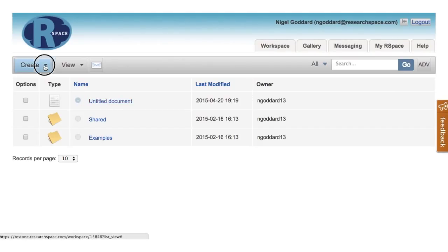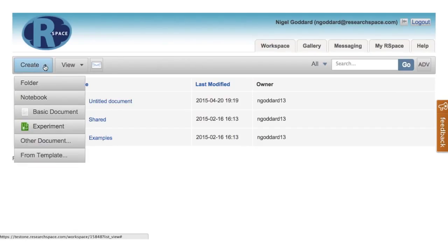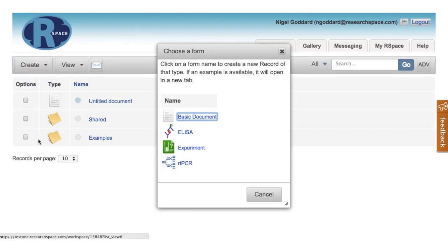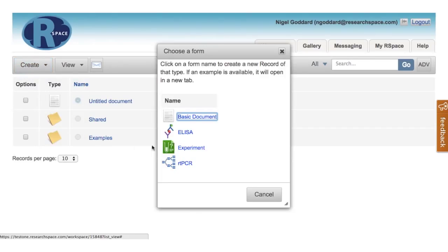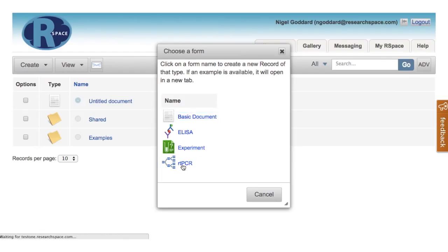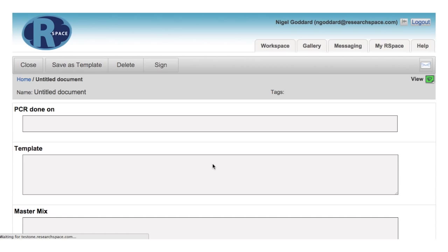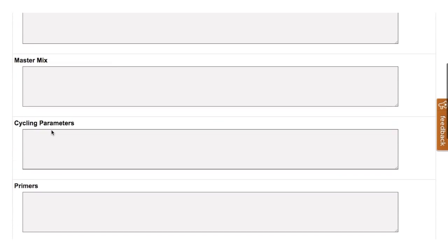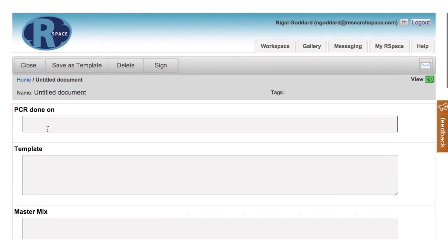And then of course we can create more documents. Now that's listed here in our menu, we can create more documents and we can create a structured document which has many fields. For example, a real-time PCR document, and we can then fill out the fields here.